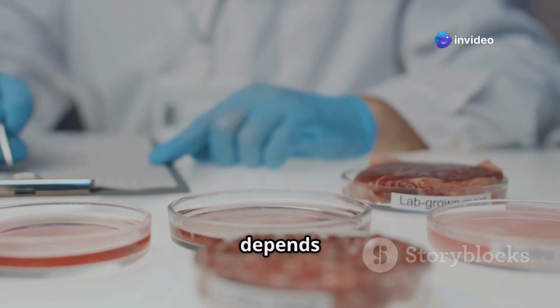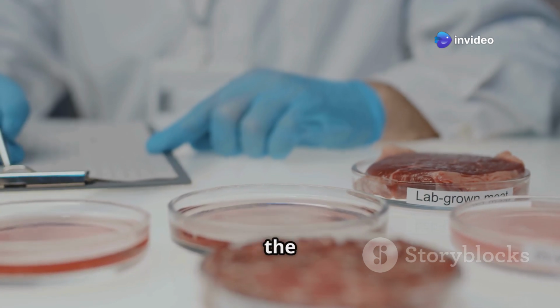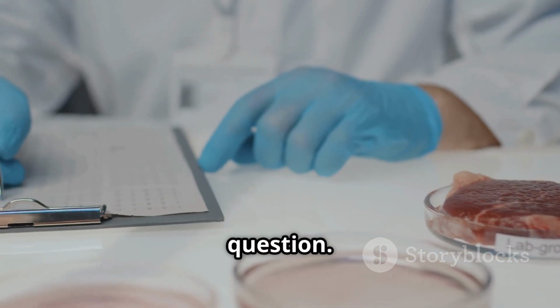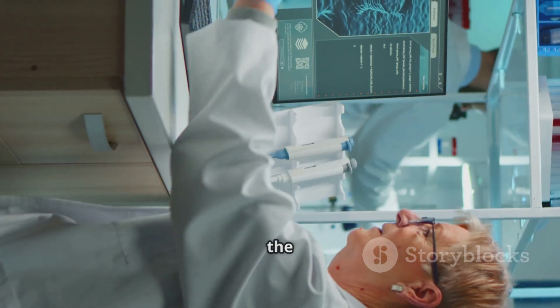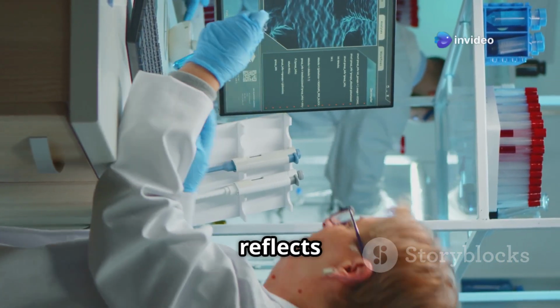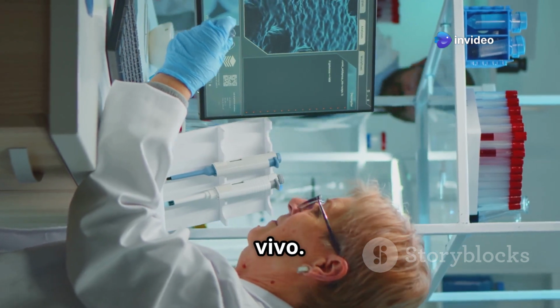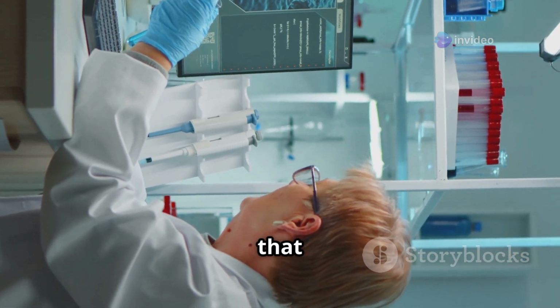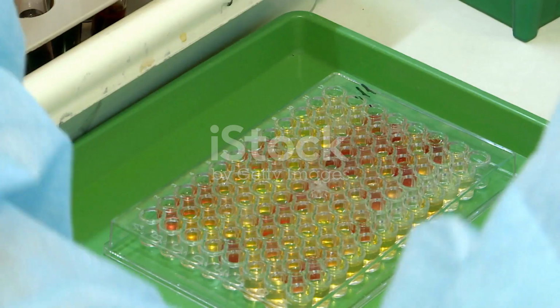The choice of membrane depends on several factors, including the drug's properties, its route of administration, and the specific research question. Selecting the correct membrane ensures that the IVRT accurately reflects the drug's behavior in vivo. This, in turn, leads to reliable and meaningful results that can guide drug development.